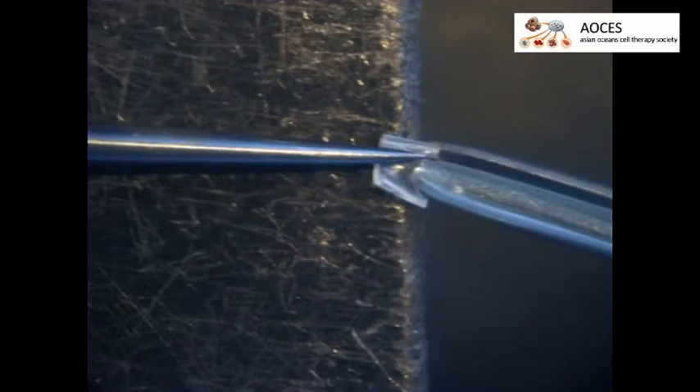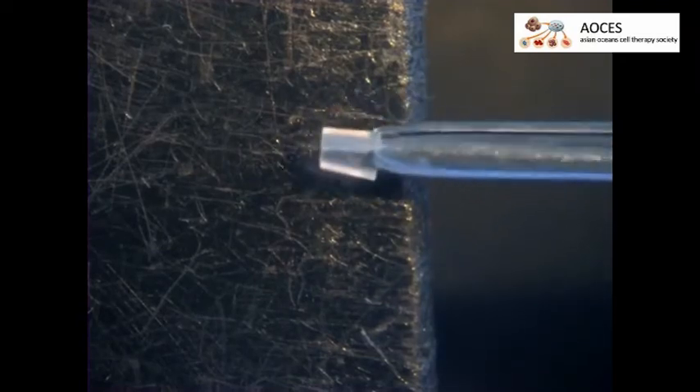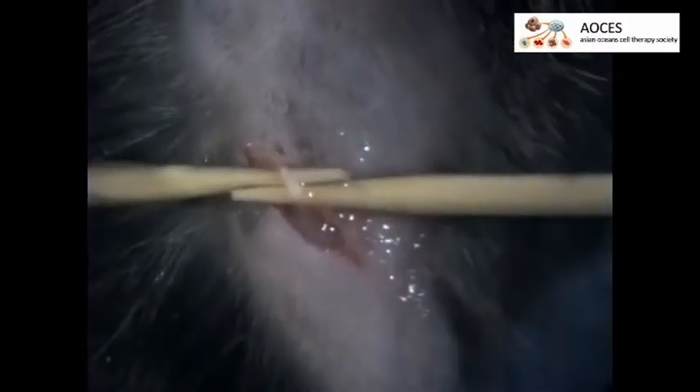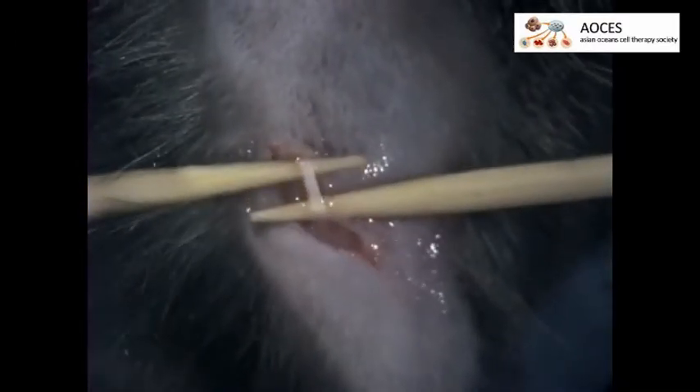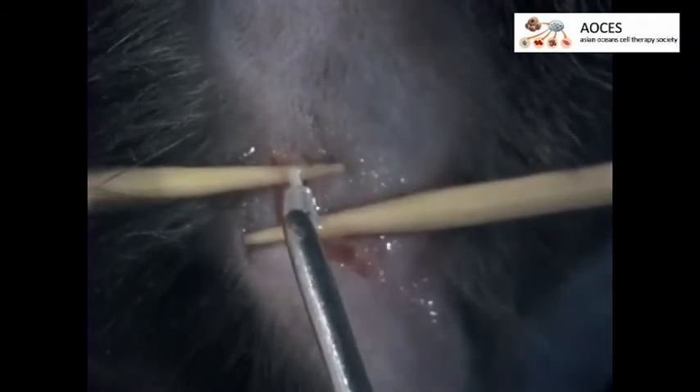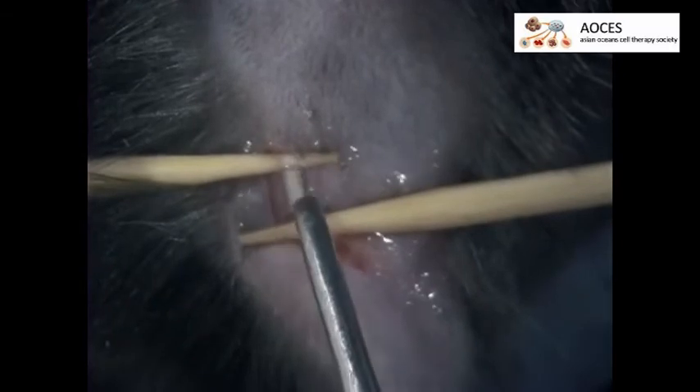Grip a split cuff with a pointed steel stick and a bulldog clamp, then insert the bulldog and rotate it 180 degrees so that it holds the cuff opposite the lateral opening. Close the bulldog and remove the pointed stick. Next, have an assistant hold the two sticks under the nerve and gently separate them to allow access to the nerve.